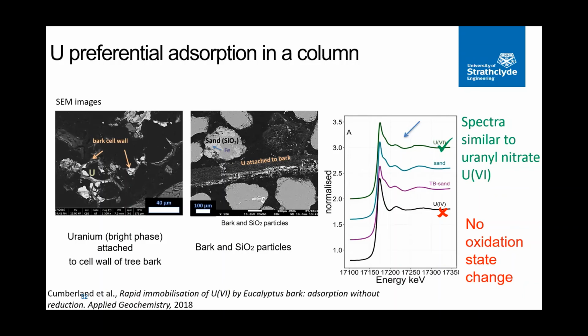This was actually agreed with a model I ran using the WAM6, putting in the same criteria. We see that it also attached to the solid organic matter and not to the sand where that was present, and that was due to the charge of the particles, with the organic matter being more heavily charged than the sand.